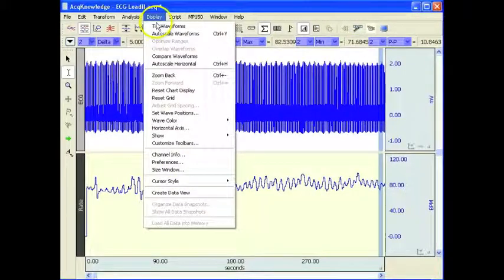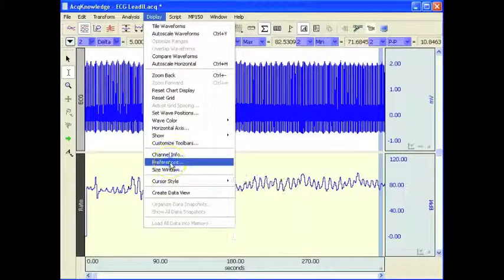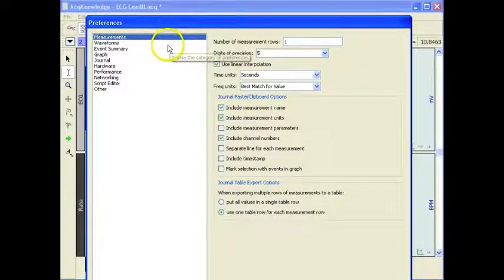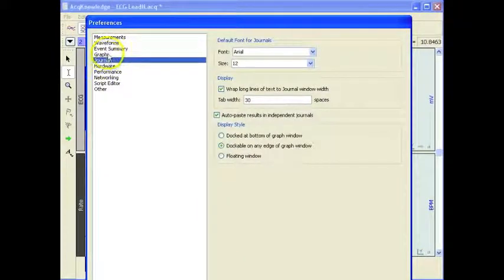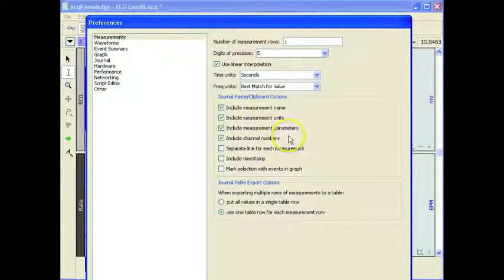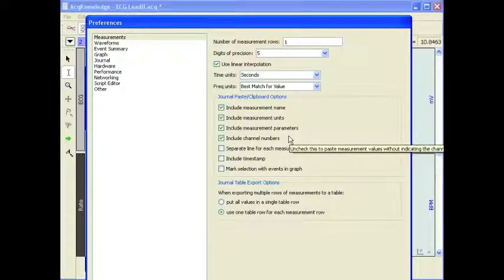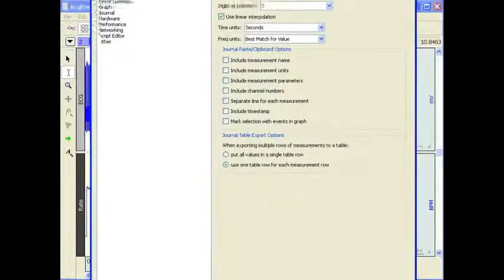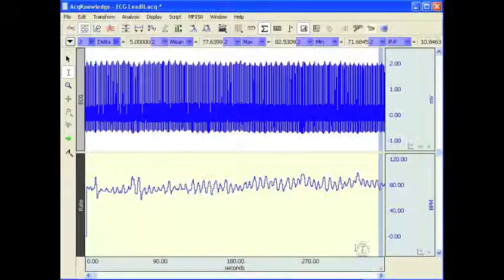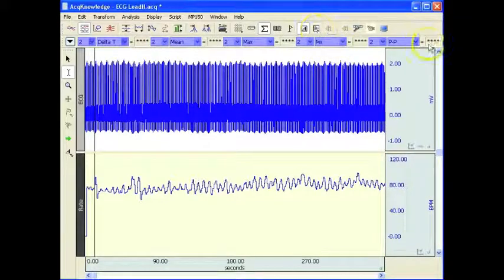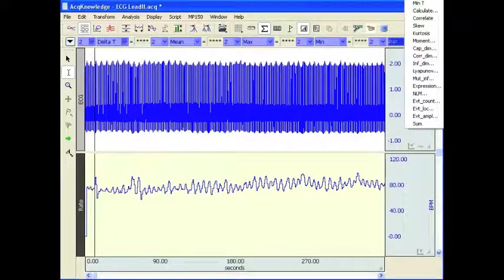We can make some changes in here. If we go to Display and Preferences, in this dialog box we can include the measurement name, include the measurement units, and include the measurement parameters. Or if I turn these off and hit OK, it will probably fit into the journal a little bit better. I'll turn this one off to none.